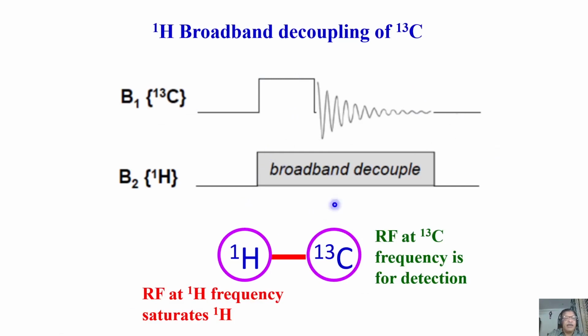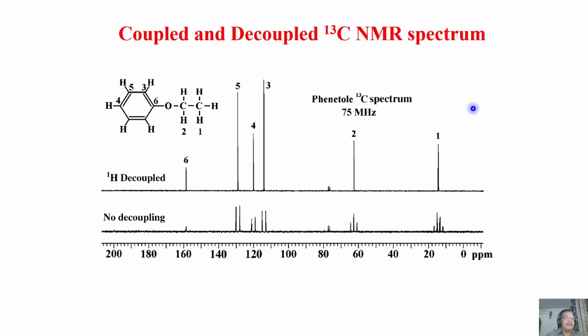See here in the figure, in the pulse sequence, we can see the power on the proton channel is always on right from the beginning till the end of collection of data, the FID. Whereas on carbon 13, we simply apply a 90 pulse and start collecting the signal like you do in a routine 1D collection of the data. There is no problem at all. The question of what happens in the decoupling, I will explain everything when we come to decoupling. When we discuss more about decoupling, when there is an opportunity, we will do that.